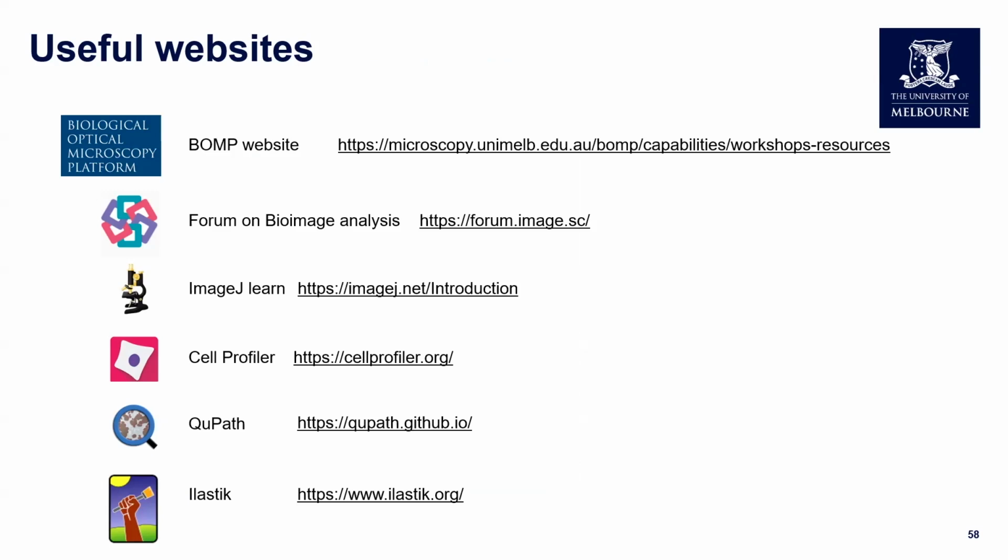The Image.sc forum is always my first stop for finding tools, troubleshooting, and workflow recommendations. It's a really active community with excellent discussions from all around the world, so this is a really important page to bookmark. Also, each software has its own website with manuals, tutorials, and worked examples, which are really great for learning specifics.